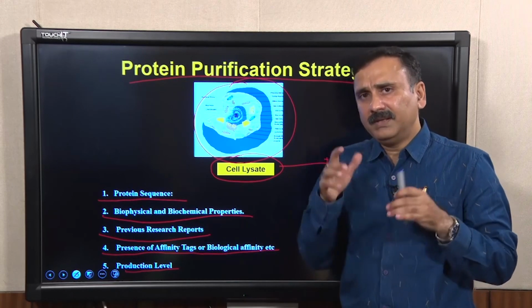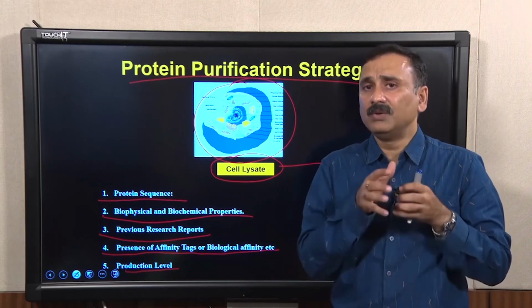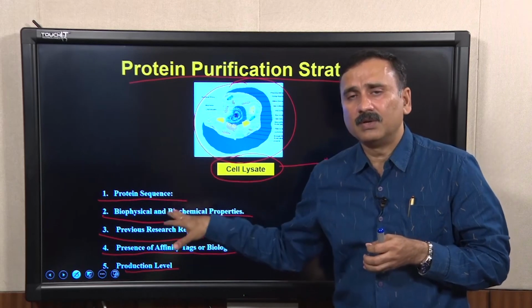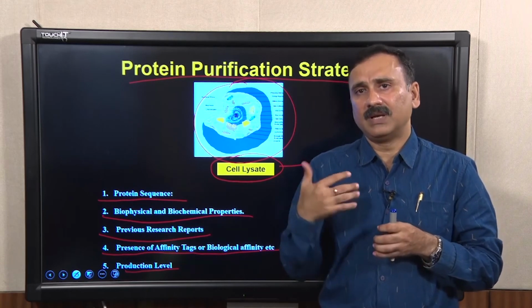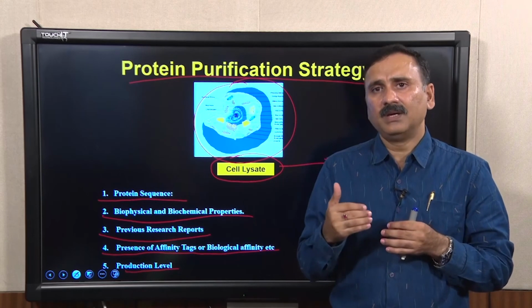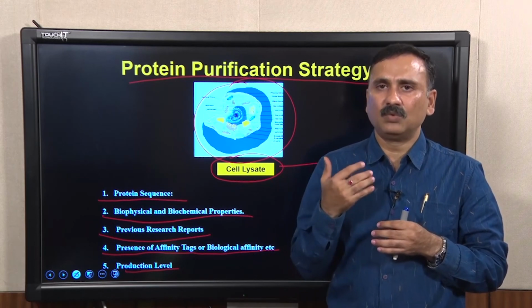So, in this module we are going to discuss the different chromatography techniques, how these techniques can be utilized to purify proteins, and also how you can utilize these chromatography techniques to answer your specific experimental or scientific questions.